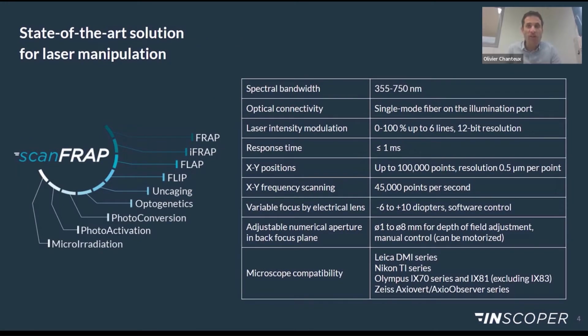I would like to conclude this introduction by highlighting some technical features. The laser illumination controller uses galvanometric mirrors to direct the laser beam on the specimen. This is something quite conventional on the market. What we do differently is the resolution of the laser parameter controls.